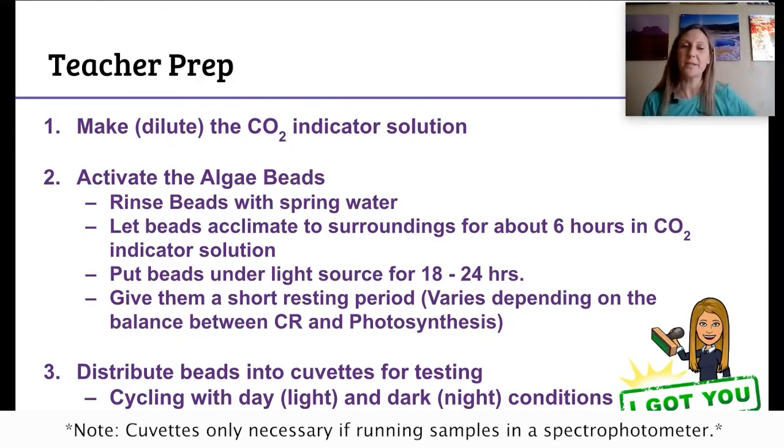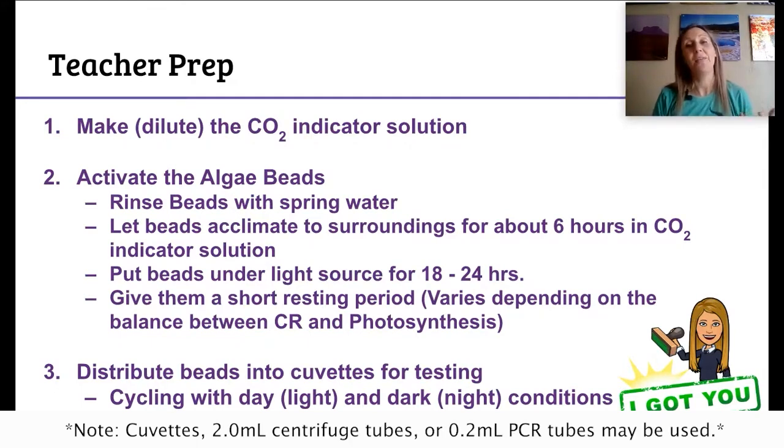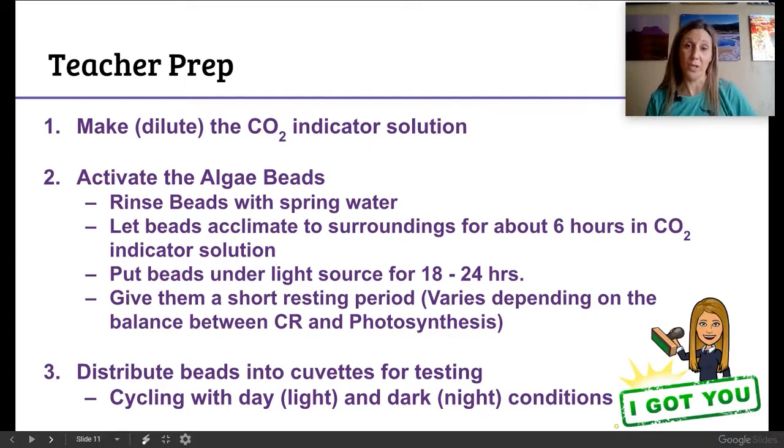So you spread out the beads into the cuvettes, you put new CO2 indicator solution on them. And then I, in the past, have just let them cycle through day and night by putting them by a window, as long as it hasn't been too hot, until the kids are ready to use them. Sometimes I get all of this done and do number 3 maybe about a week before I'm going to do the lab with the kids, just to make sure that the beads are cycling through as they should. So that means by the end of the school day, they're purple, or the CO2 indicator solution is purple. And then when I come in the morning, it's yellow.